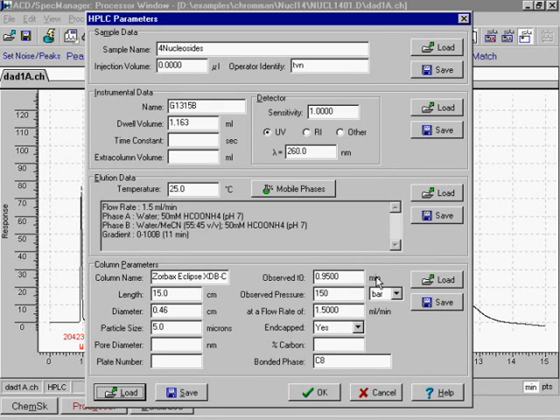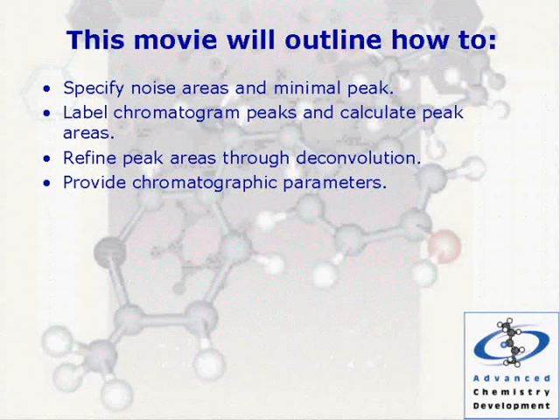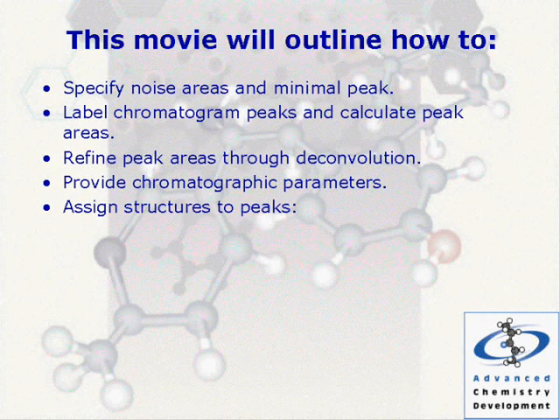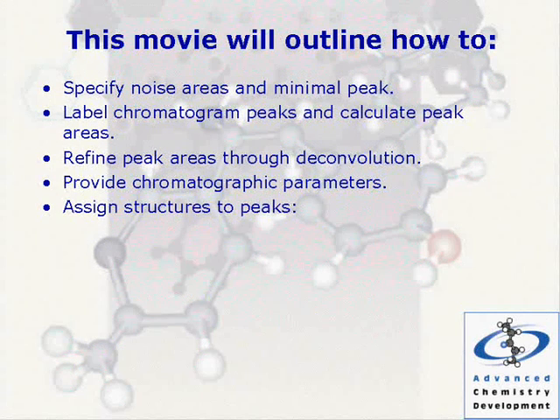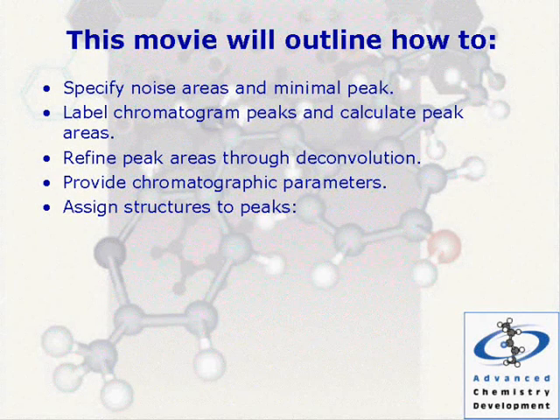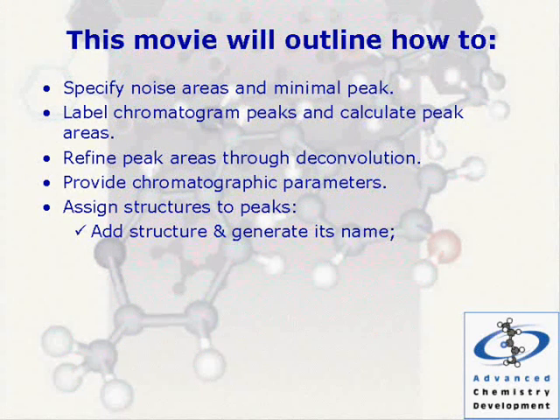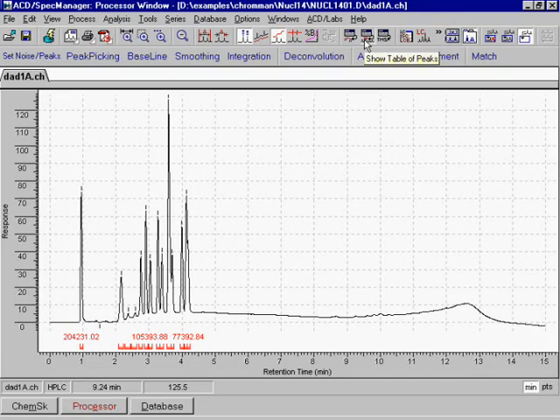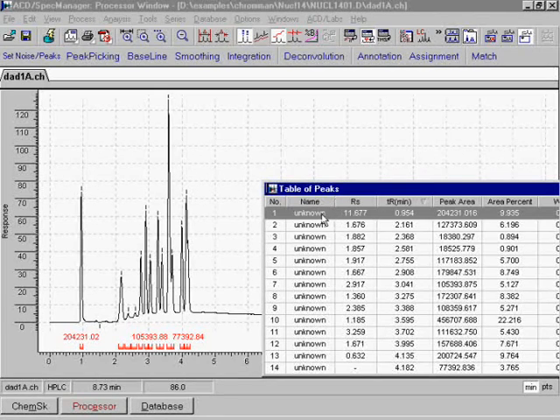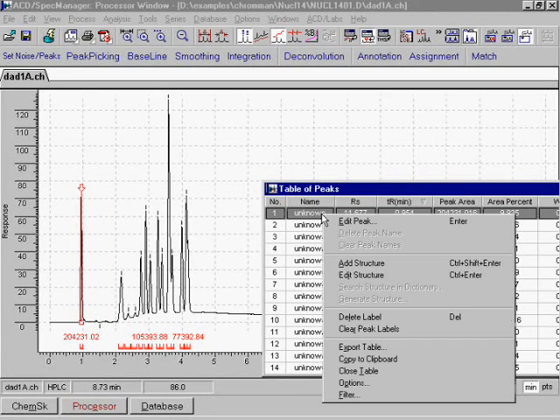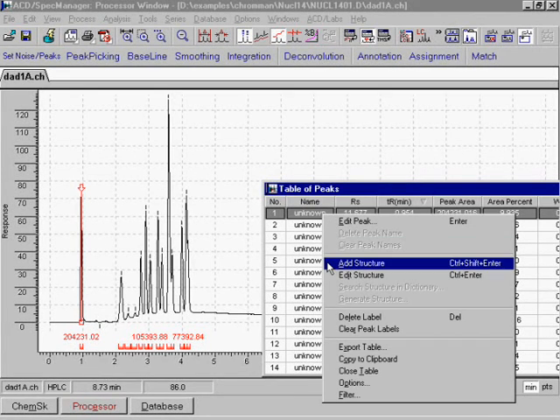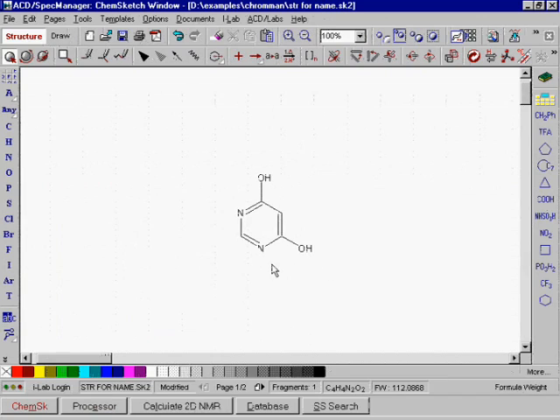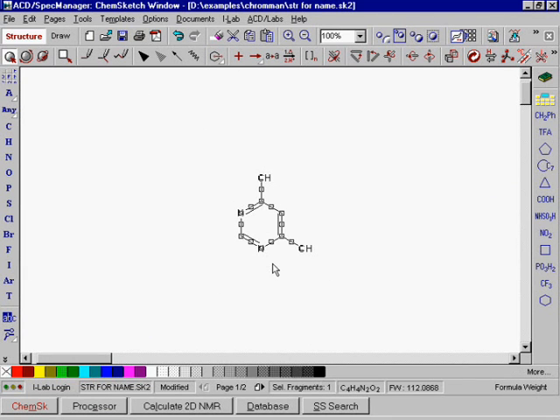Now we will show how to attach chemical structures of the compounds to the corresponding peaks. This can be done in several ways. Add structure and generate its name. Using the table of peaks, we link a structure drawn from the ACD ChemSketch window to a peak on the chromatogram. Furthermore, through the table of structures, we generate its index name.